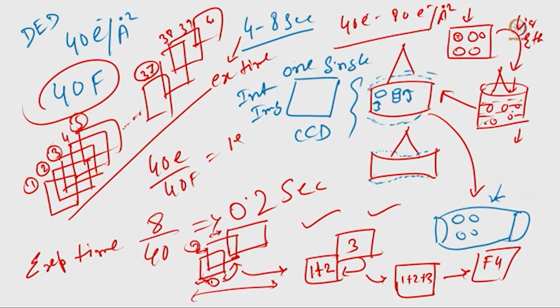There are a lot of things you have to consider when you align those frames and do the motion correction. This entire process is called motion correction. We will collect the data and then we will do the motion correction. This is the first part when we discuss data processing.